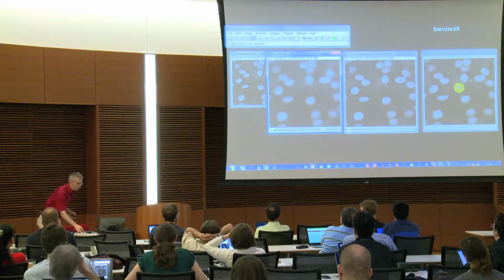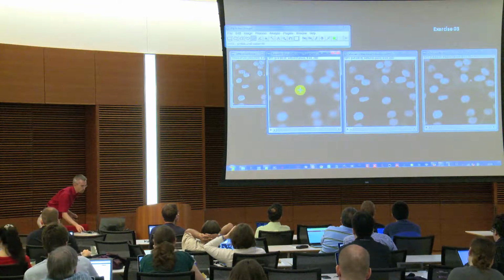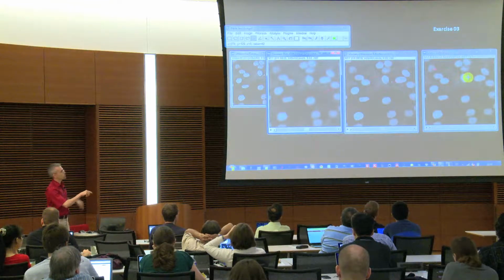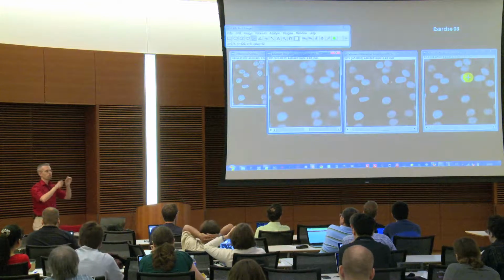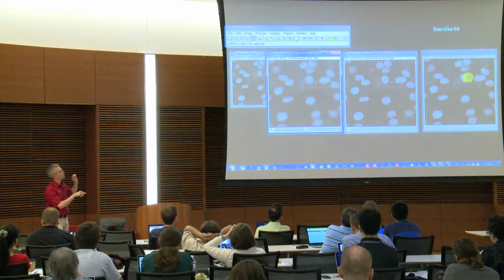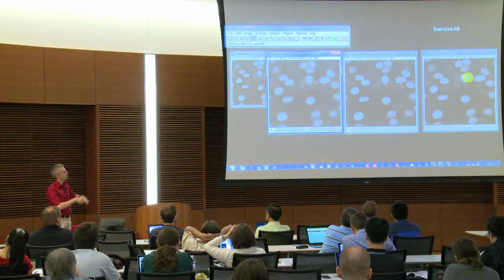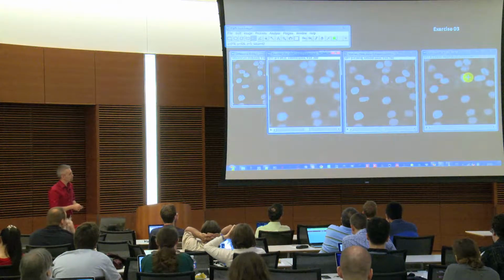And the mean in comparison, you see that if I go a little bit lower, for example, to 5 in all 3, the mean actually is somewhere in between those two, but it keeps differences a little bit stronger. So the Gaussian reduces noise stronger than the mean, and the median actually also, spot noise is eliminated very well here. The mean keeps those bright spots a little bit longer.